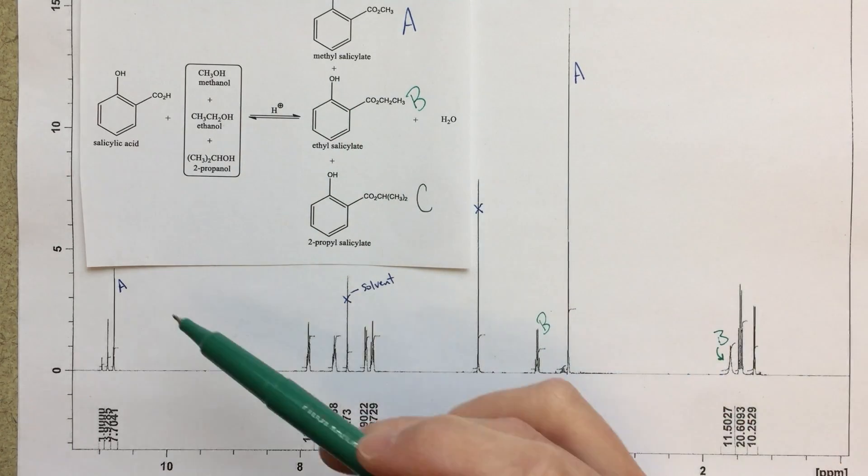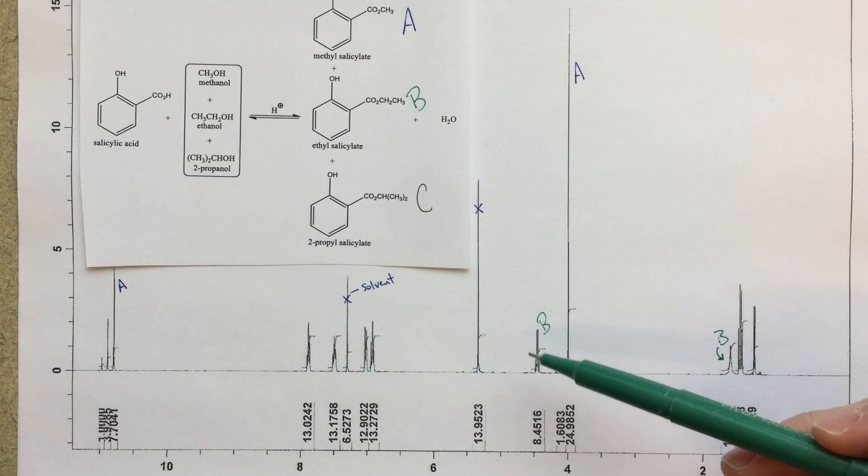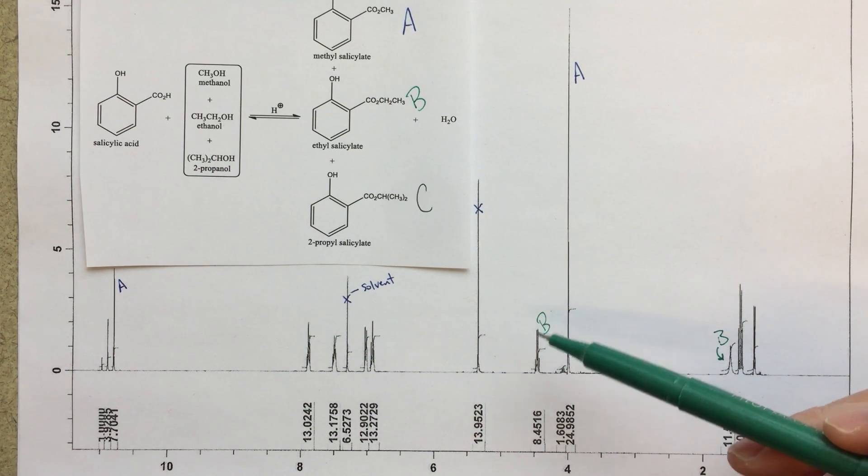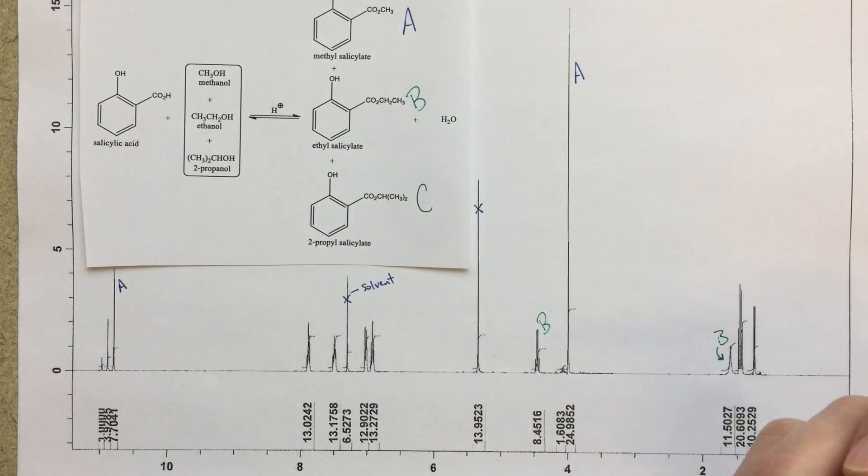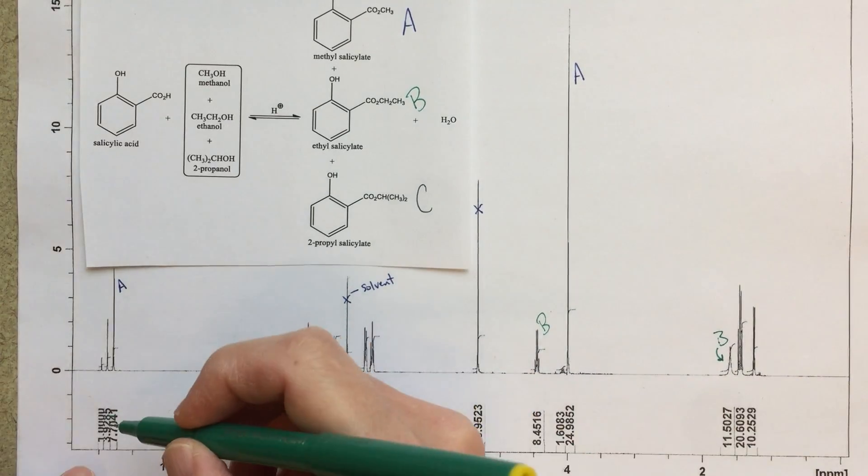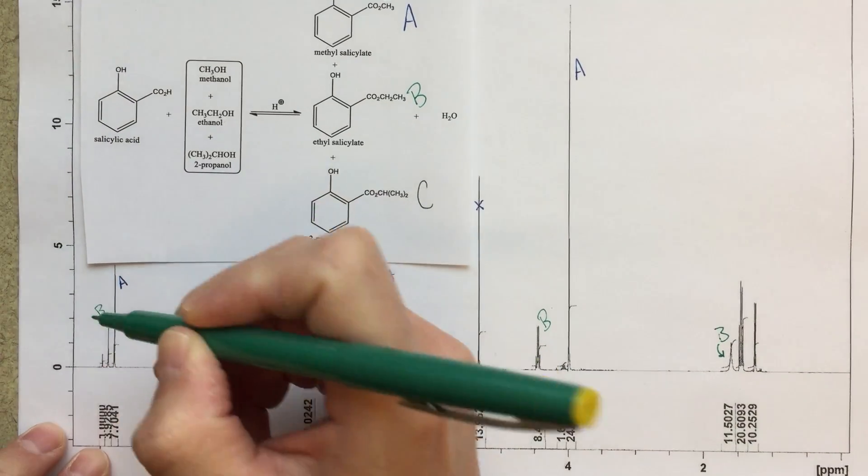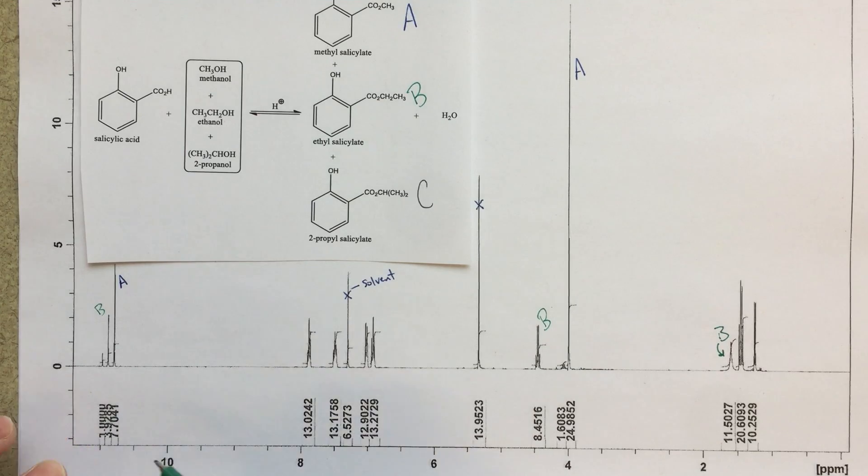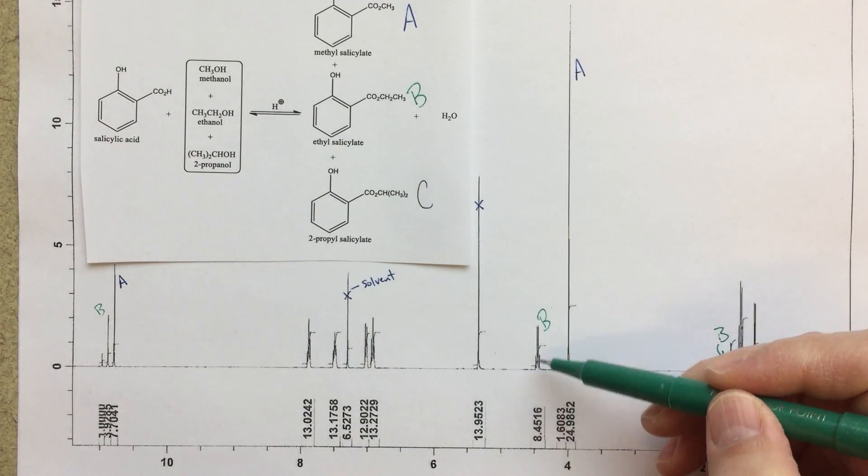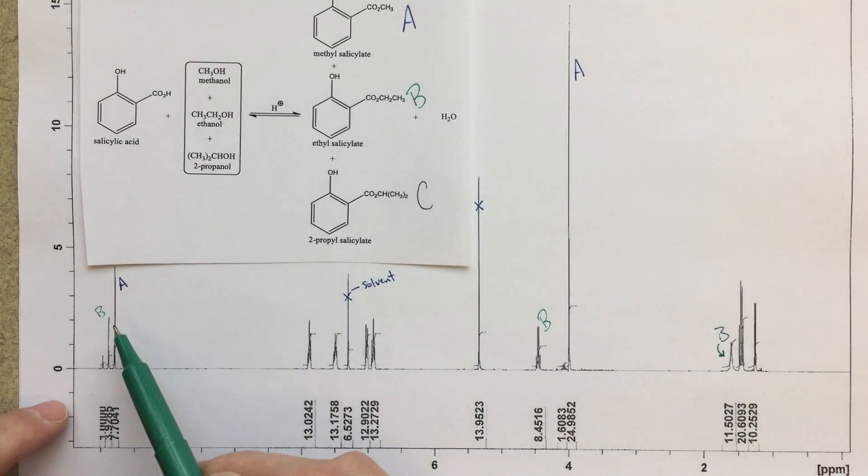So if I could find a peak out here that integrates to about half of this CH2 linker, that should identify that as B as well. So the one in the middle integrates to about four, so 3.9285, that's about four, double that, that should be eight, and we've got that peak here. So I think very clearly, again, this peak here should be our B peak.